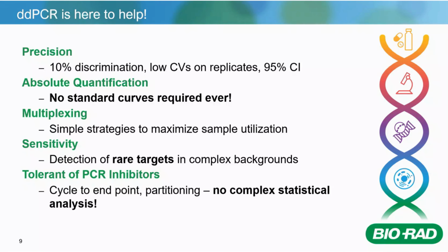What happens is if you have that inhibitor present in your sample, it interacts with the enzyme, your supermix, and it totally causes your real-time PCR experiment to fail because it's free floating and it can destroy all your reaction. However, in Droplet Digital PCR, the partitioning, or the droplets, are formed before your PCR run.